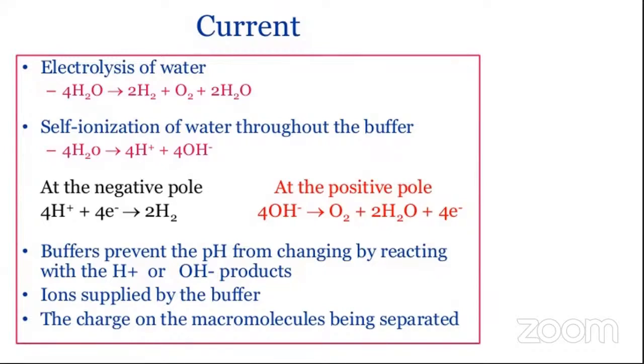As we have already understood this aspect of electrophoresis, mostly the charge will be carried by the buffer ions, and the macromolecules will just be allowed to carry the charge, but they will never reach the electrode. So now, is it a fair question to ask that if I increase the voltage during electrophoresis, will the current be proportionally increasing, or will it not?